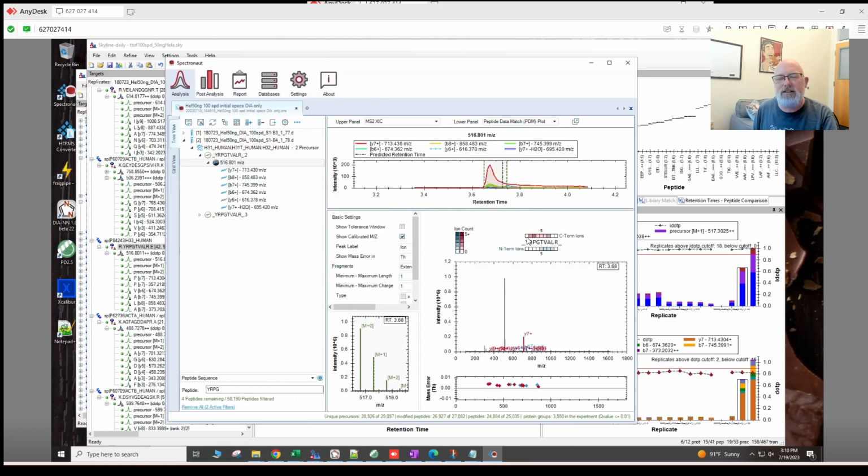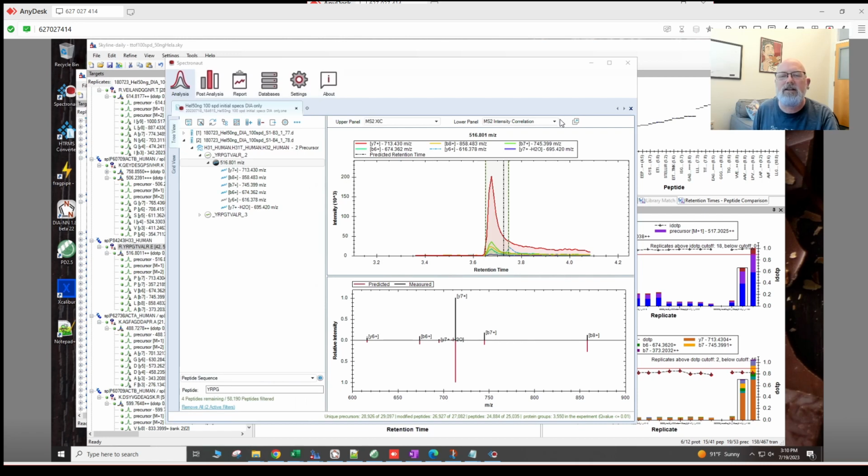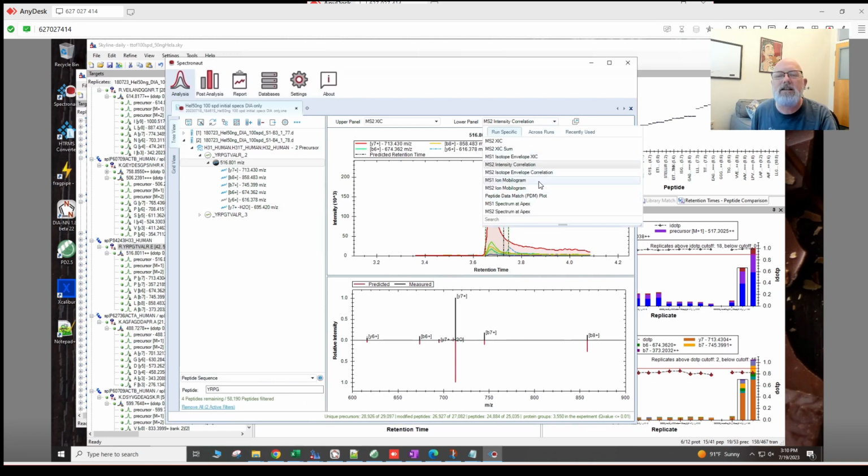What's amazing about DIA is that it just picks this stuff right from the background, right? You totally believe it though. I believe it. Let's see, intensity correlation. Yeah, okay. Let's see if we could do retention time.